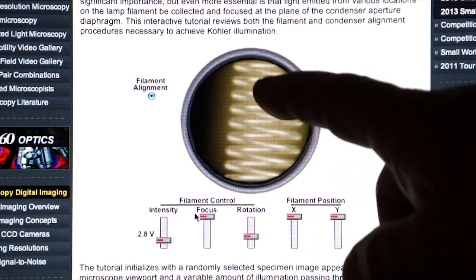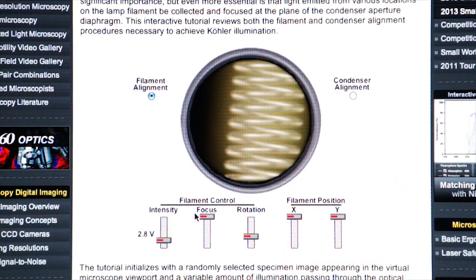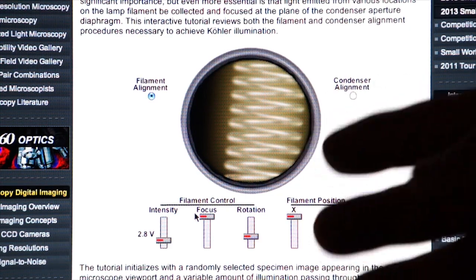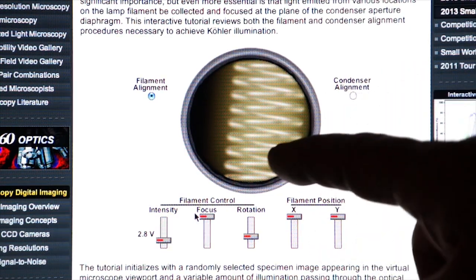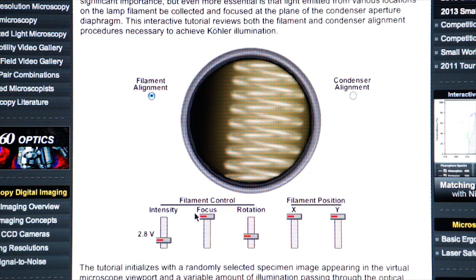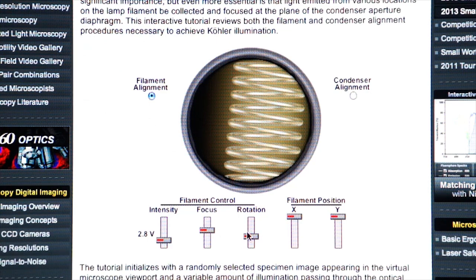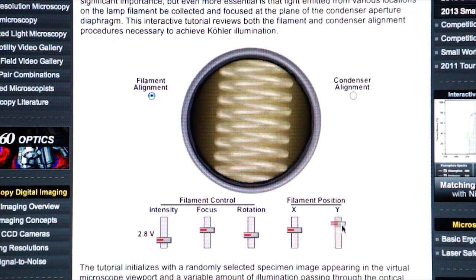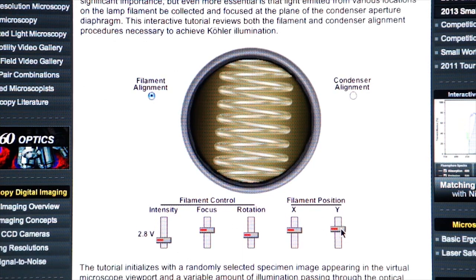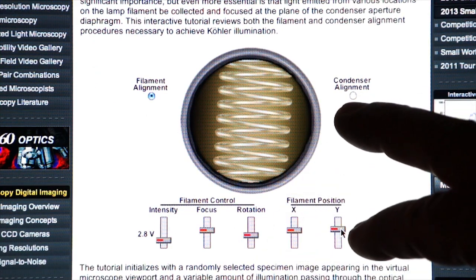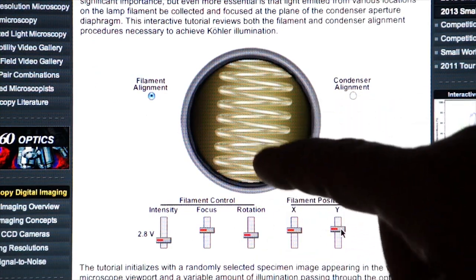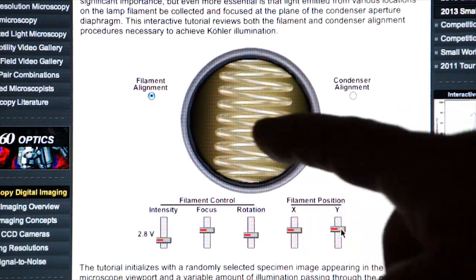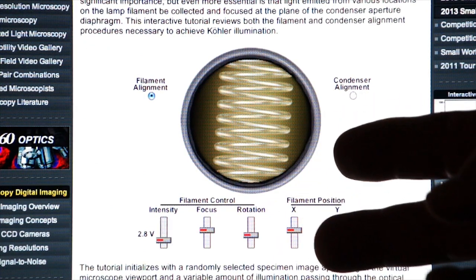Here you see the actual filament which shows up in the field of view. In modern microscopes it's not as important to do this because the modern bulbs are already pre-centered, but here we can focus on the filament, make sure it's nice and sharp, rotate it, and align it in X and Y so that it's fully aligned to the center of the microscope. You shouldn't have to do this with modern microscopes, but it gives you an idea of how important the lamp is to the illumination.